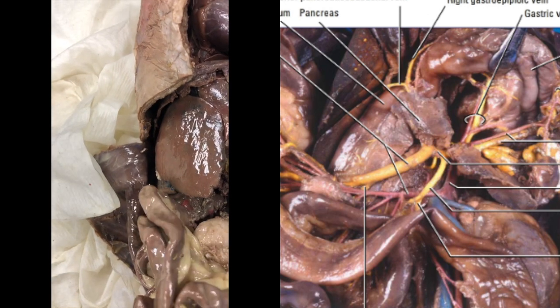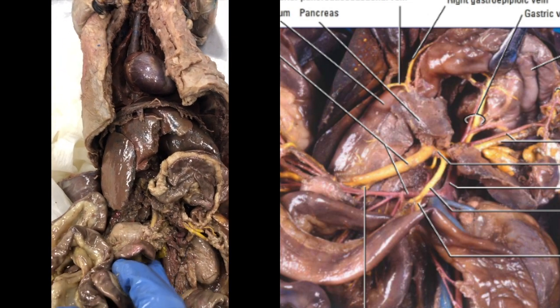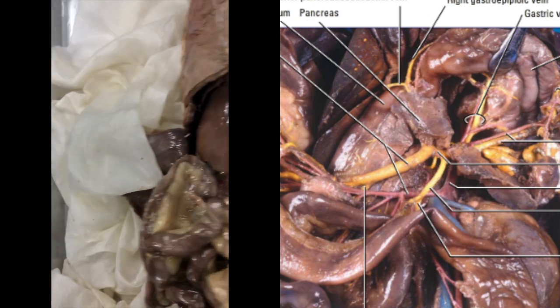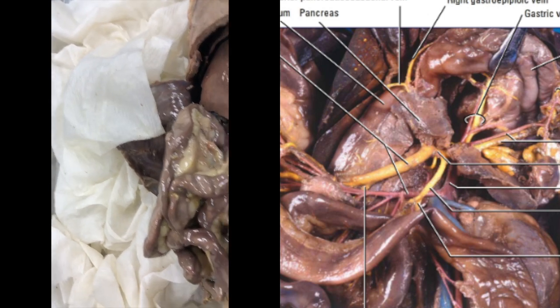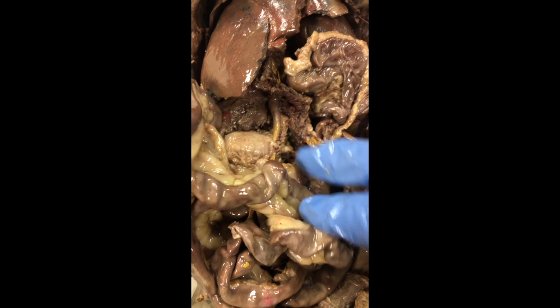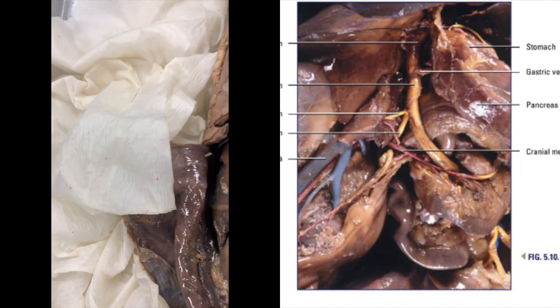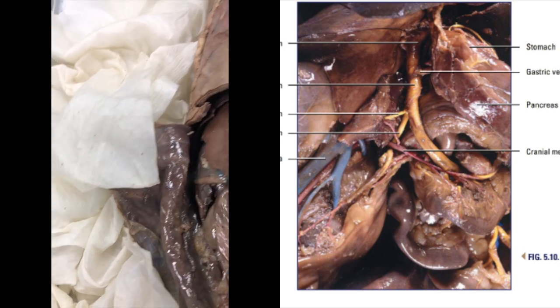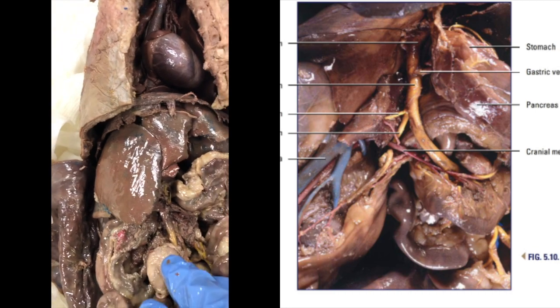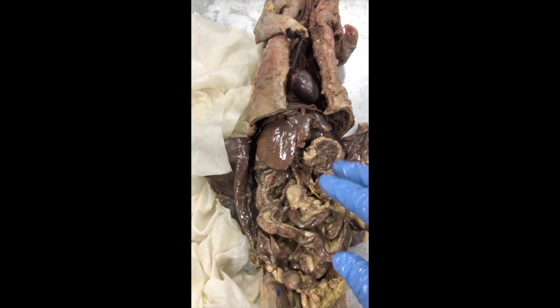And then the inferior mesenteric vein drains the colon and some of these lower structures. So coming from down below, there's that. The one going into the liver, right here, is going to be your hepatic portal vein. And then immediately below that, the last thing to drain into it is going to be from your superior mesenteric vein. So that might be tough on test day, but I don't think we'll make it too hard.